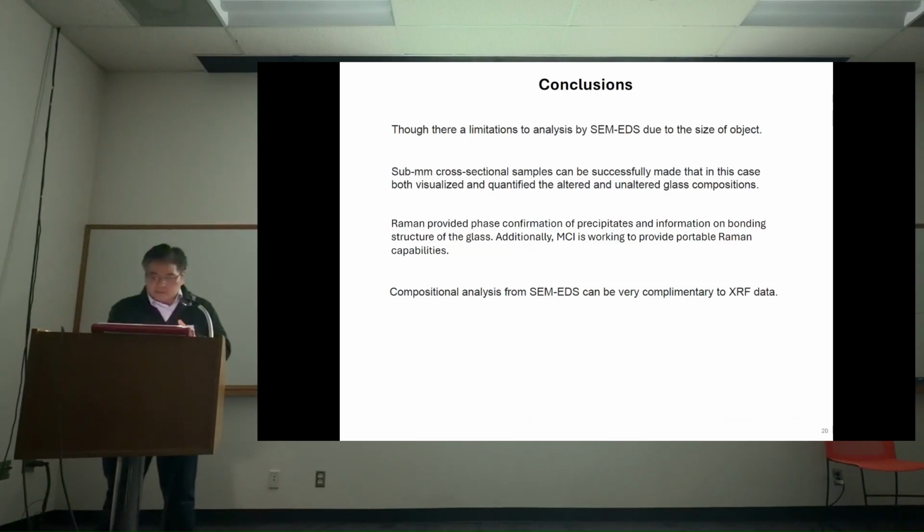The final conclusion is that a lot of my work revolves around this, but I'm lucky in that I don't just have an XRF, I have an SEM that's pretty close to the XRF. We find in a lot of our research that SEM EDS is very complementary to XRF data and can help us explain a lot that can often be confusing. And that's it.